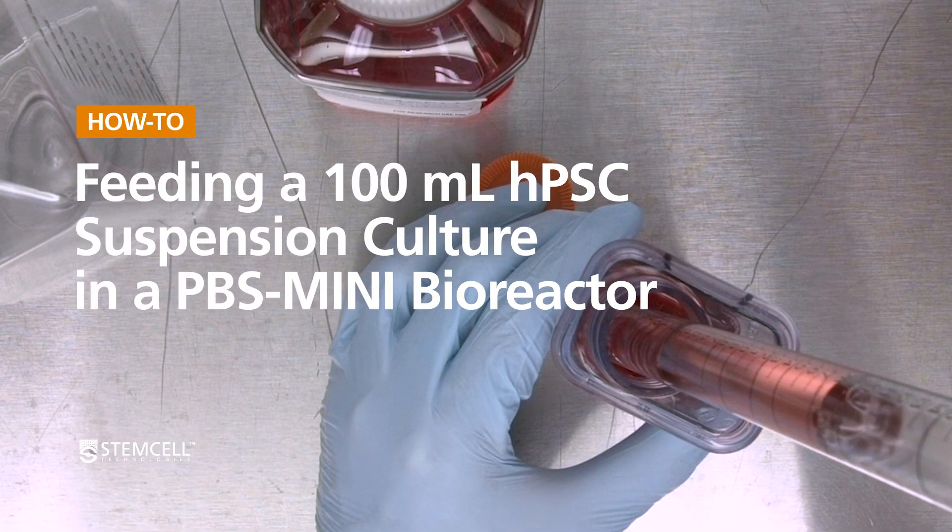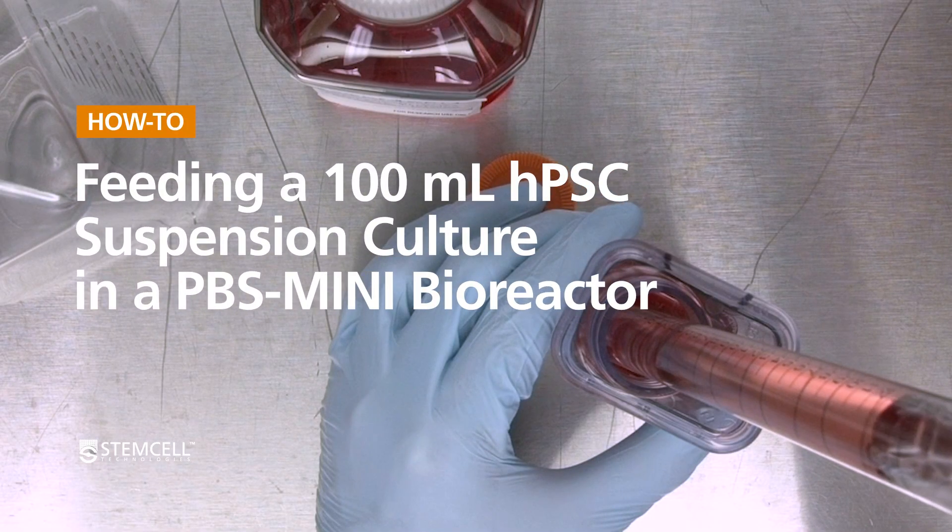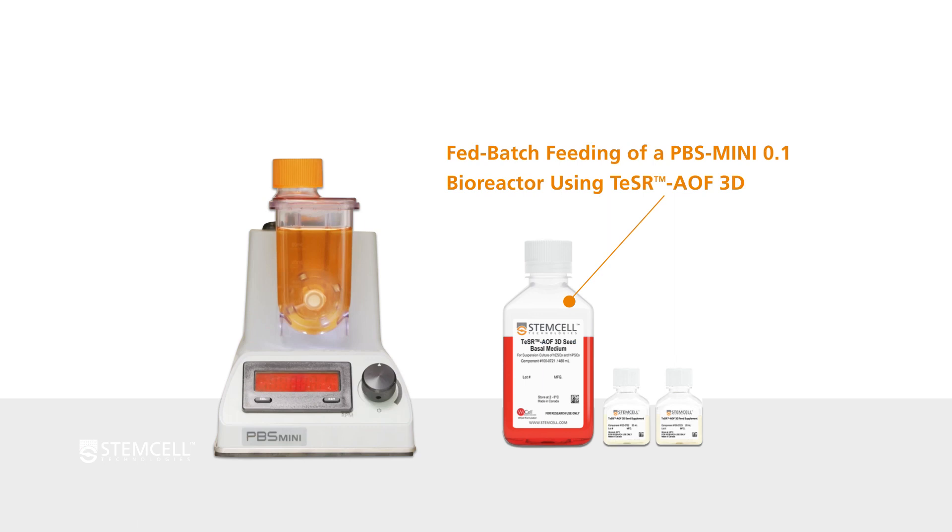In this video, we will demonstrate how to perform a fed batch feed in a PBS Mini 100ml bioreactor containing HPSC aggregates in 3D suspension using TeSR AOF 3D.